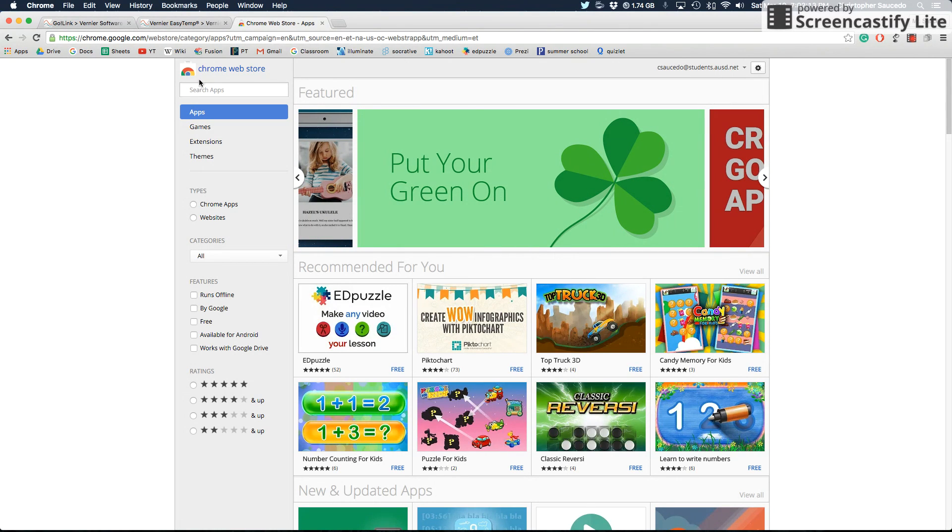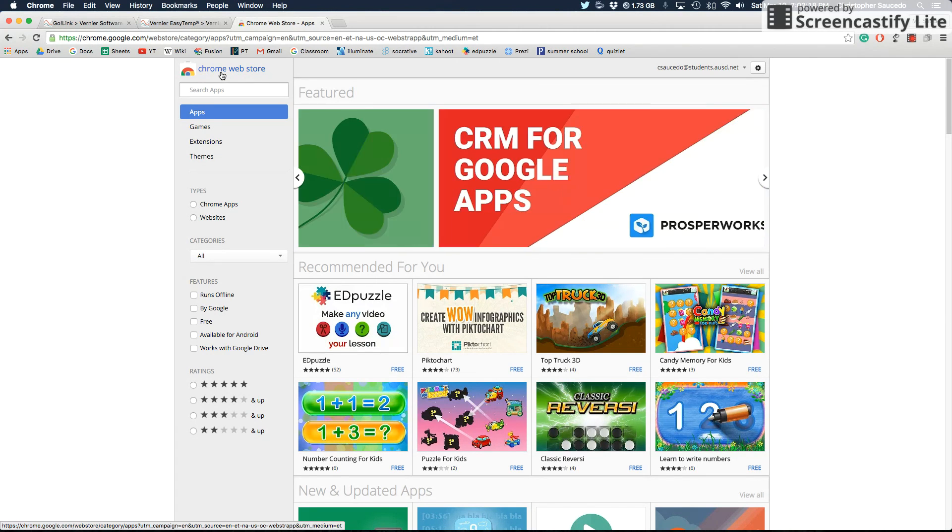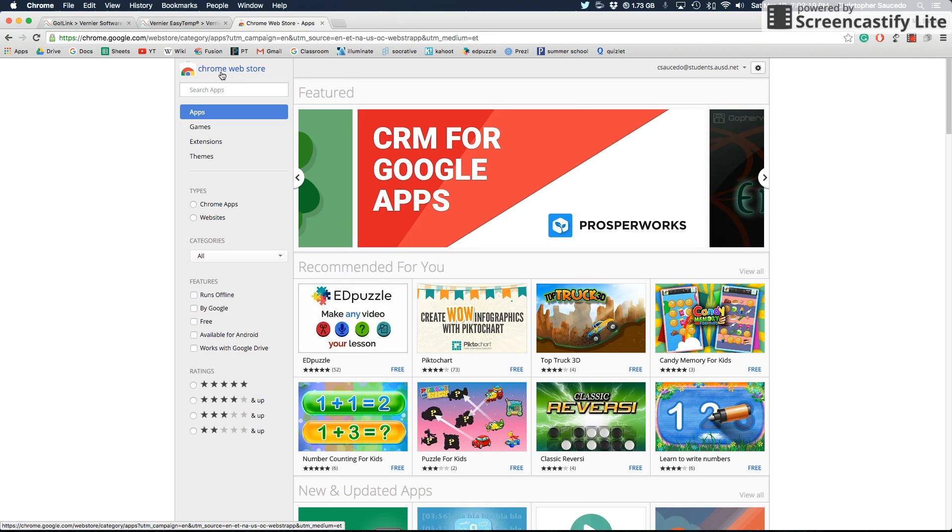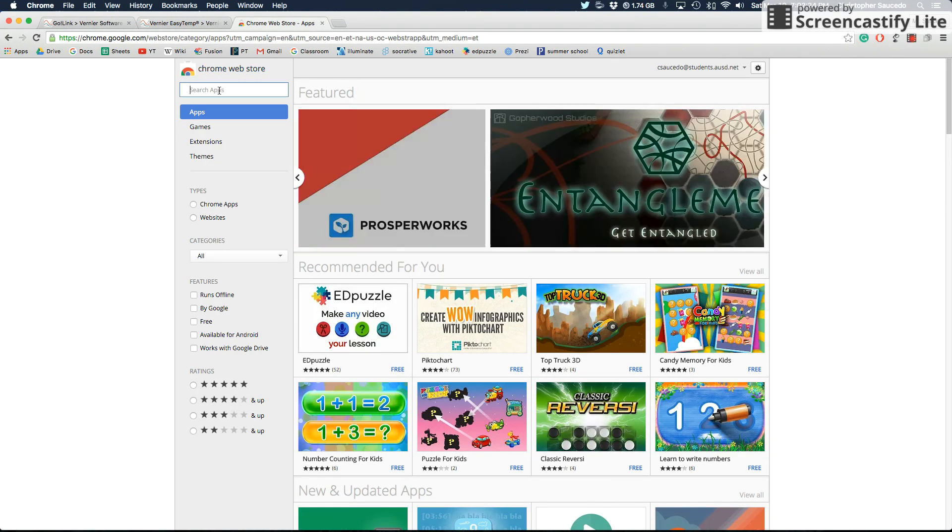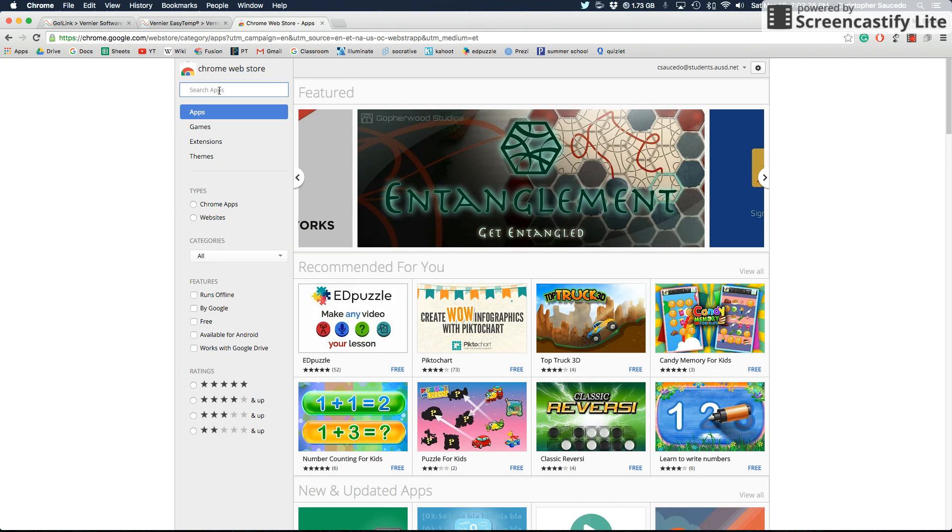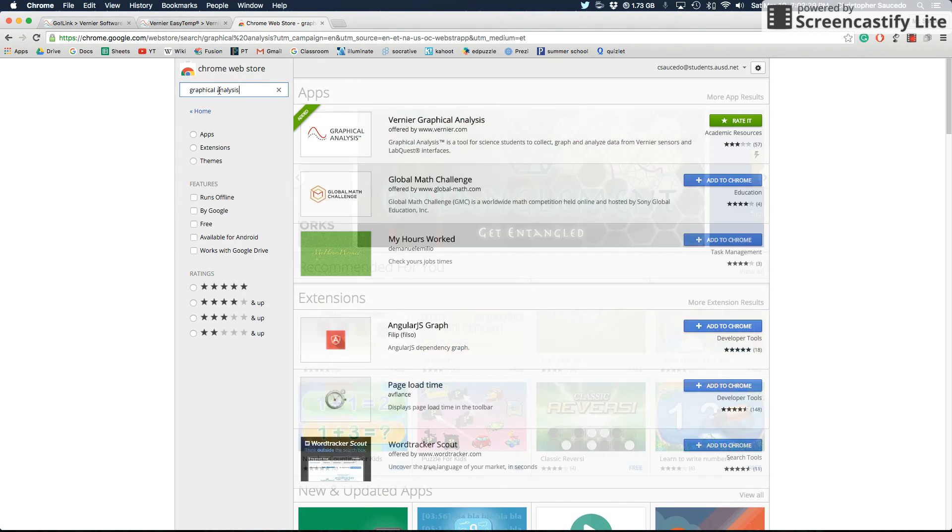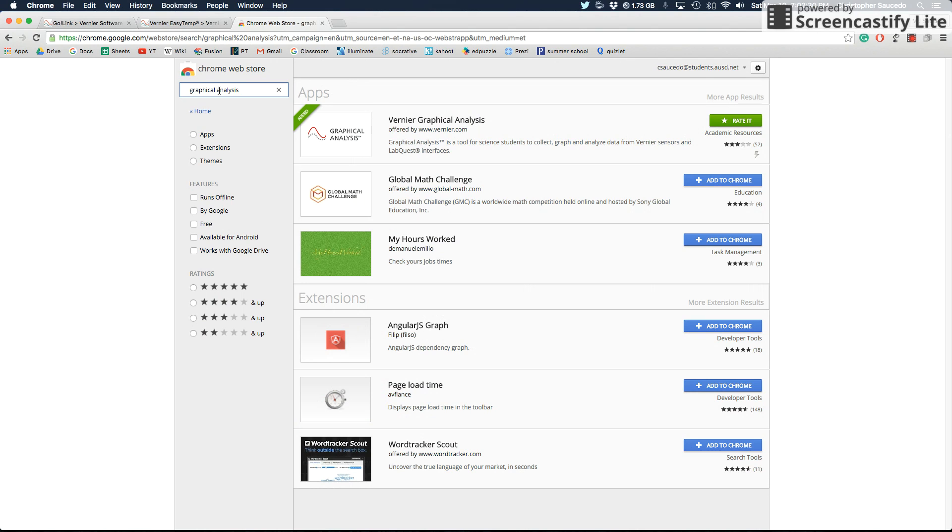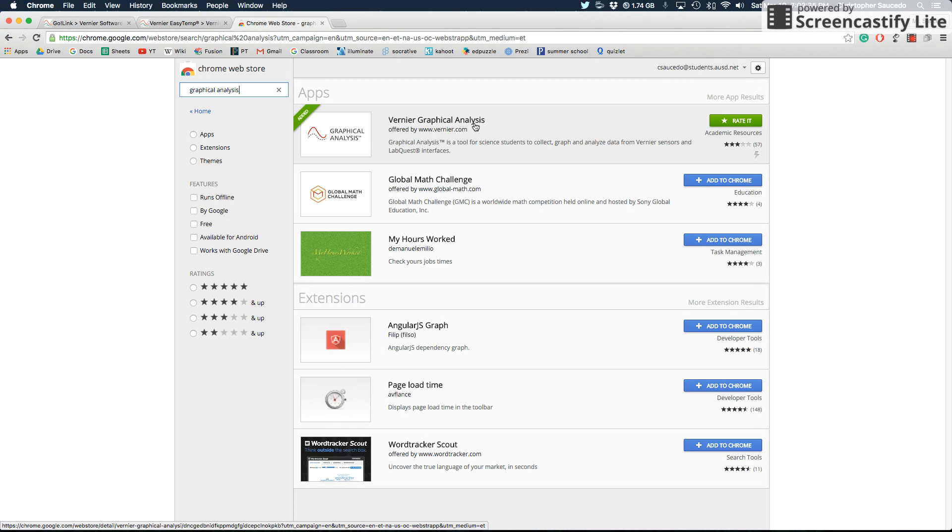The first thing that you're going to need to do is go to the Google Chrome Web Store on your Chromebook. You can just type Google Chrome Web Store into Google, or if you have the icon, you can just use that. You're going to want to search for graphical analysis. The reason why we're searching for that is because the piece of software that we're going to be installing is called Vernier Graphical Analysis.